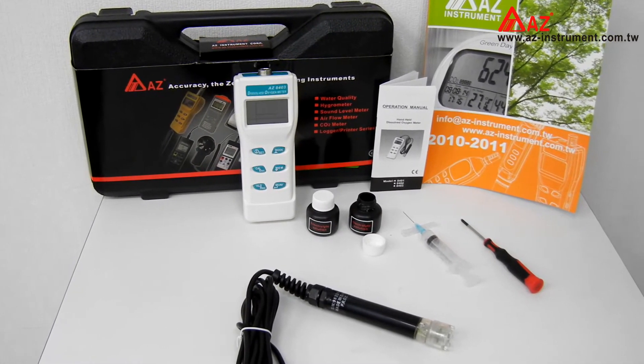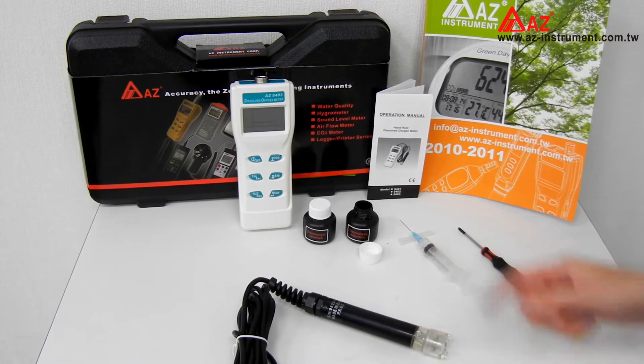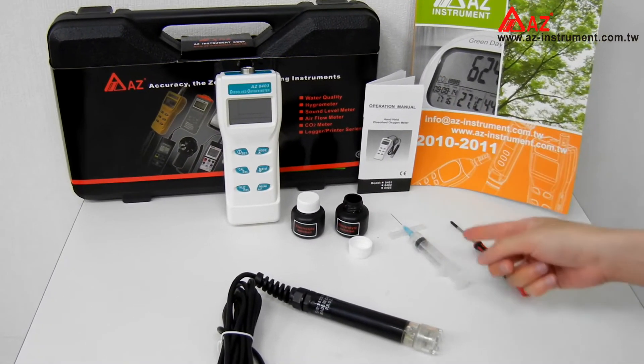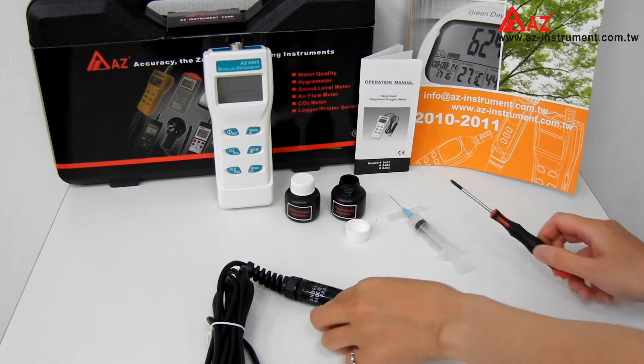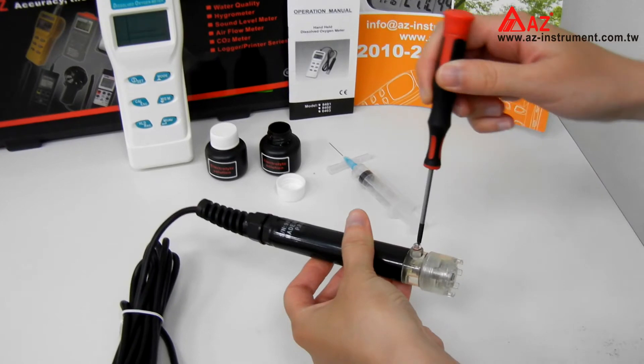Now let me show you how to refill the electrolyte. Get the fresh electrolyte and syringe from the package and prepare a screwdriver. Use the screwdriver to screw out the nut with the washer and O-ring.